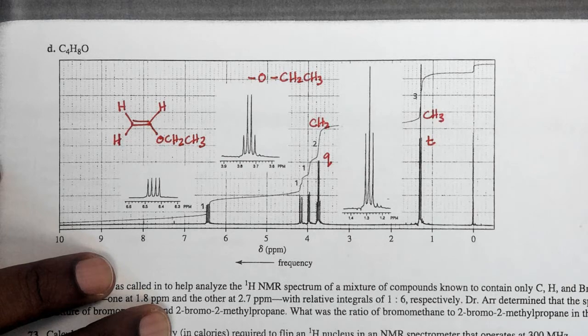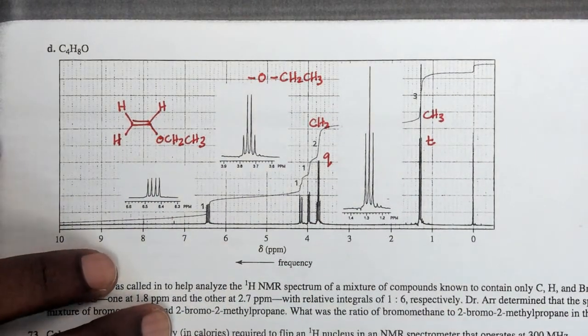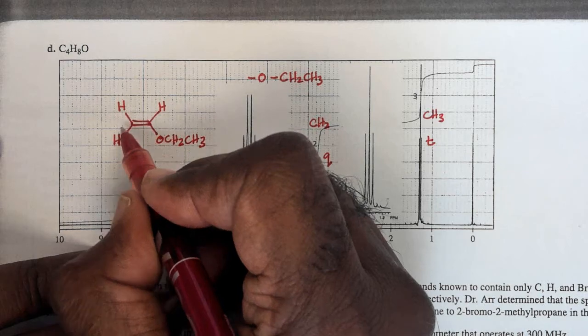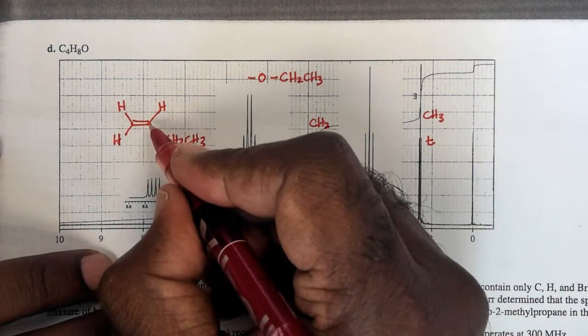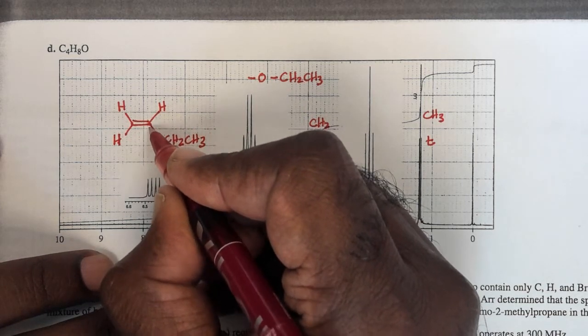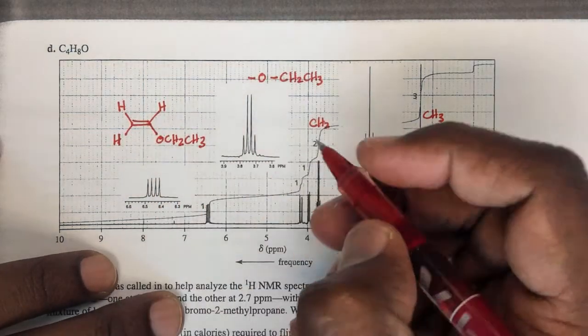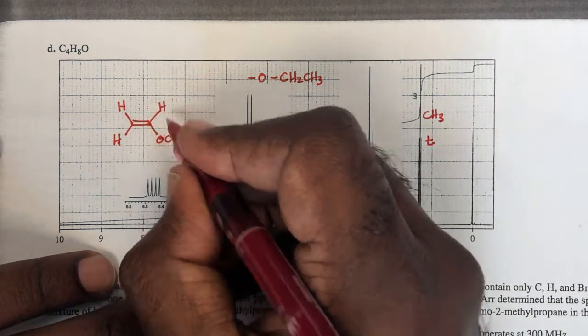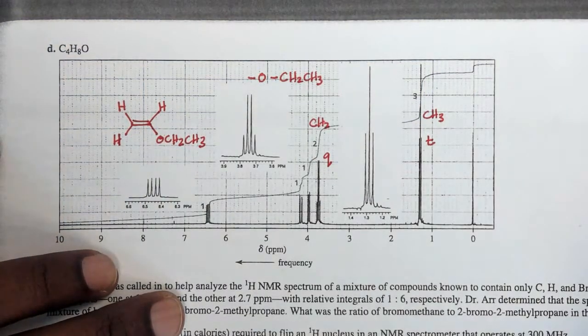But let me look at this structure and analyze it a bit more carefully. I look firstly at these protons here, that proton there, and that proton there. It's distinctly different from this hydrogen on this carbon, because in this carbon I have oxygen directly bonded to it. So it's oxygen, carbon, hydrogen, and that's why this proton is so de-shielded, because of this oxygen atom.